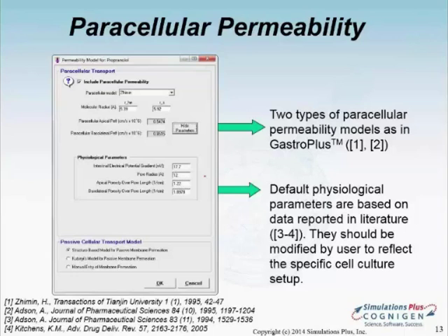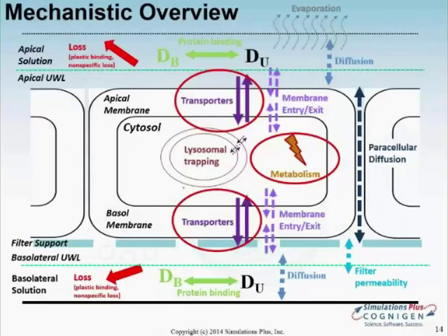If you incorporate also some of the charged paracellular markers, then you can use the full optimization model to fit all of these parameters and have the paracellular pathway calibrated for your specific cell assay, for your specific culture conditions and the assay setup.